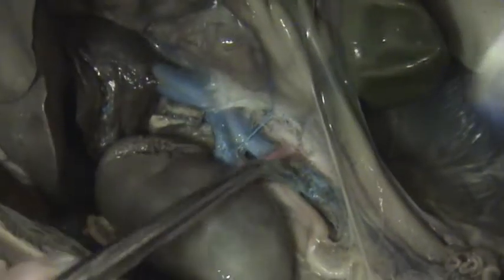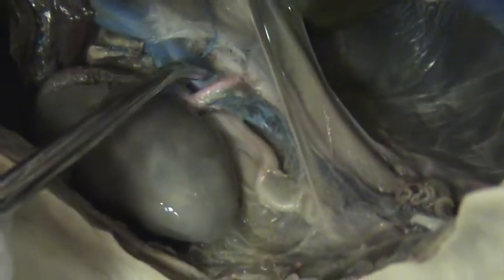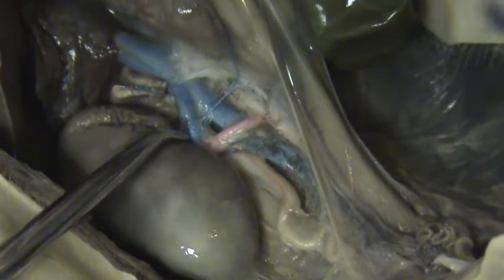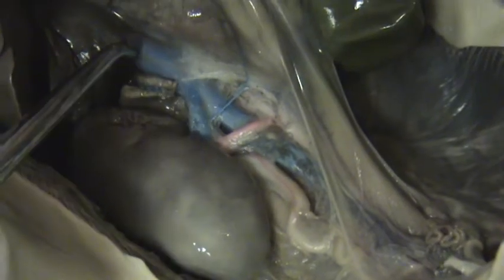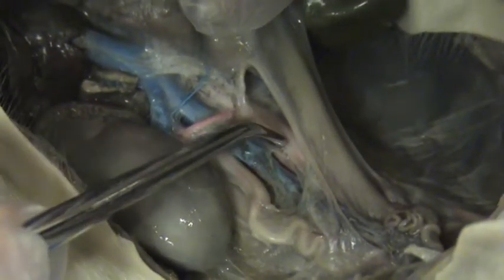And you see the blue thing here, that's the inferior vena cava. It starts down here and goes all the way up. Wait, that's the vena cava. That's the inferior vena cava. The renal vein goes into the inferior vena cava and then up. From the kidney? This is a female, from the kidney. Cool. Okay, this one next to it is the dorsal aorta.